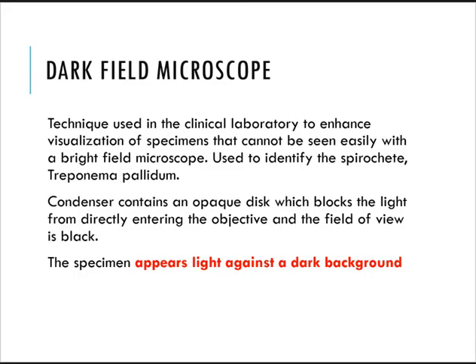Okay, now next we have your dark field microscope. Basically, it is the polar opposite of the bright field microscope.